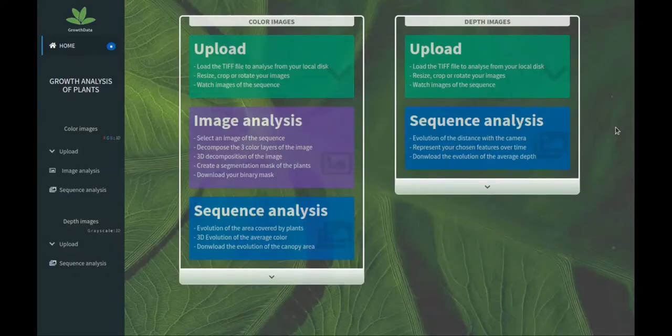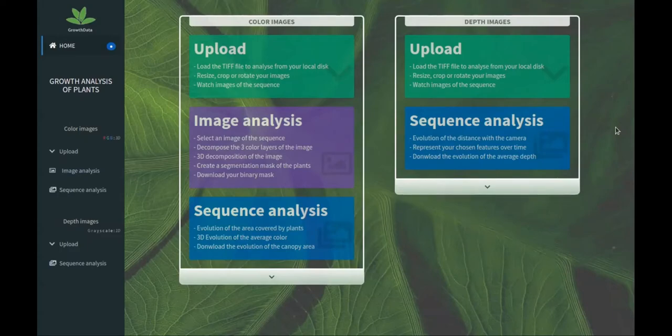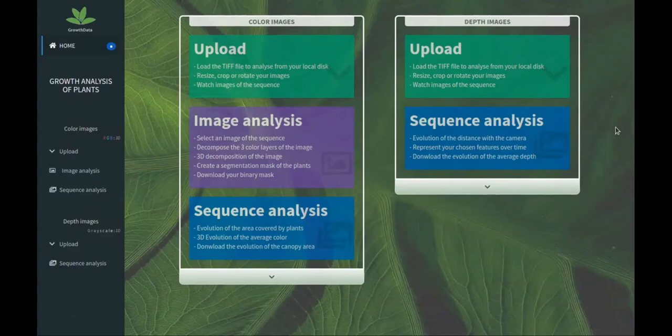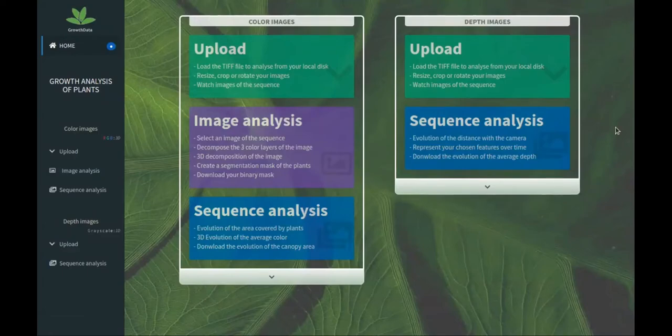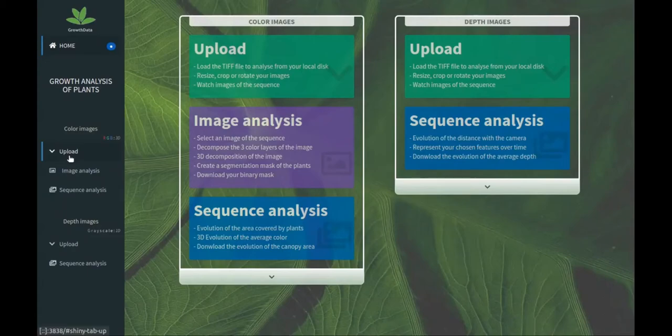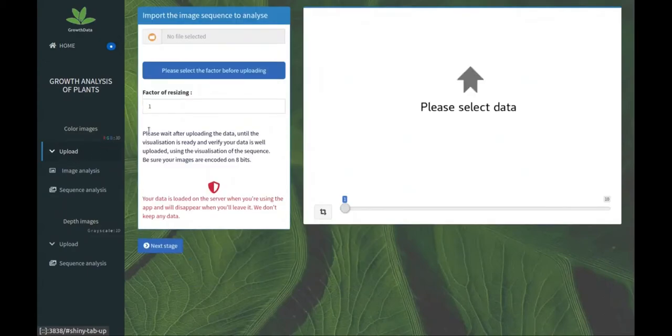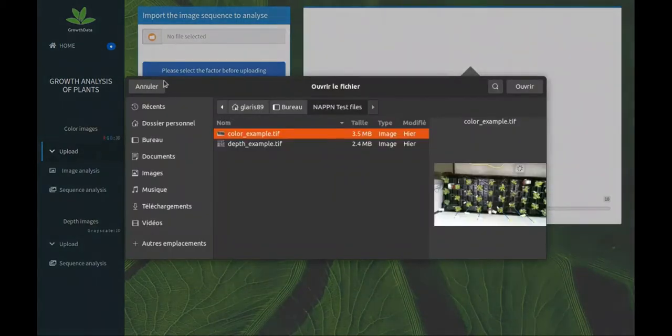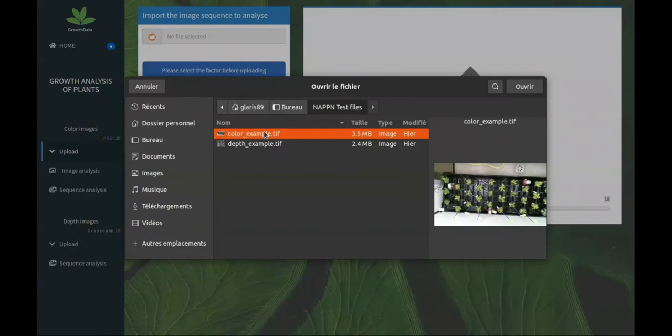Here we are on the user interface growth data. We're at the home page and we have the choice to treat color images or depth images. We have three steps for color images: upload, squeeze the sequence images, and analyze one image or a sequence. For depth images we upload the sequence and we can analyze the sequence. Let's go for color images.